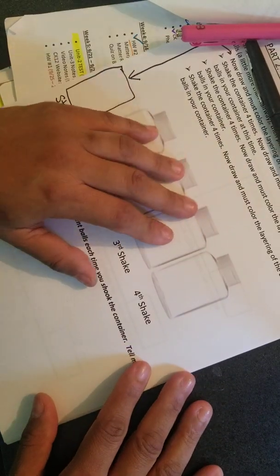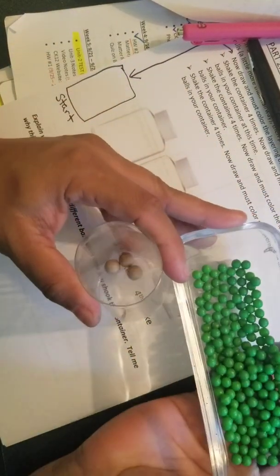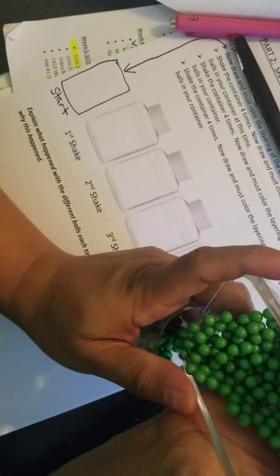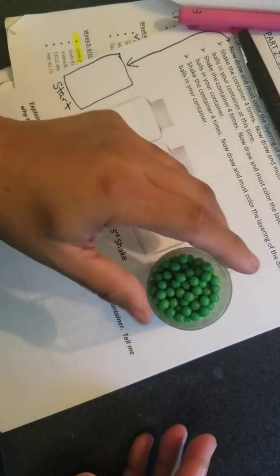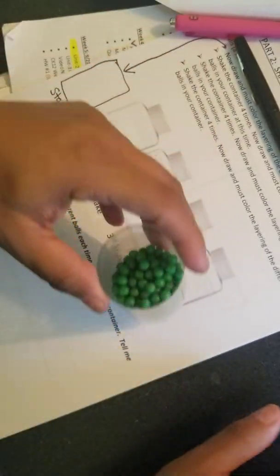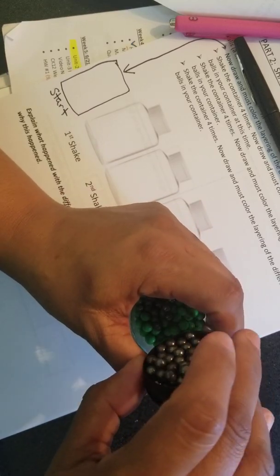Alrighty, there. Now my hands are free. Alright, here's my container. I'm going to add the green BBs first because that's how it said we're going to layer them. And if we were in class, you would be doing your own, but we're not, unfortunately. There they are. The brown ones at the bottom, then the green ones. And then go ahead and layer the metal BBs on the top.